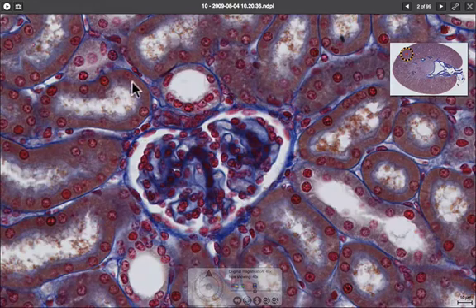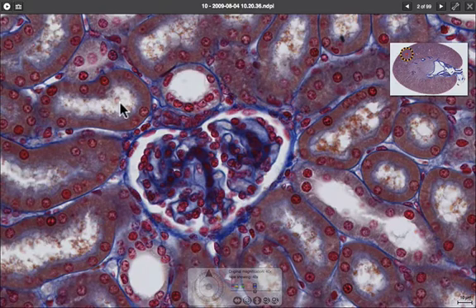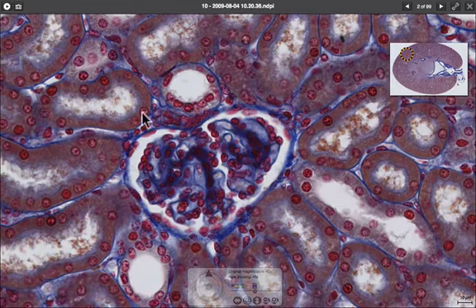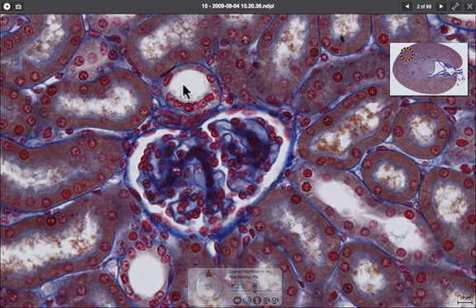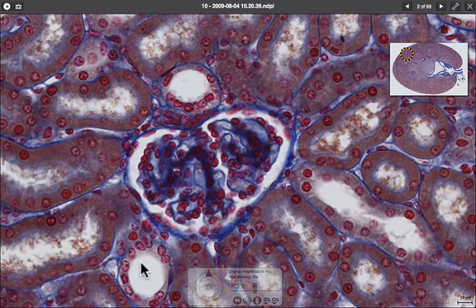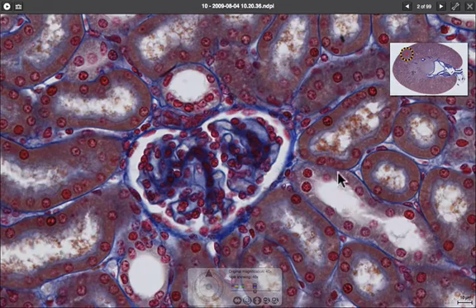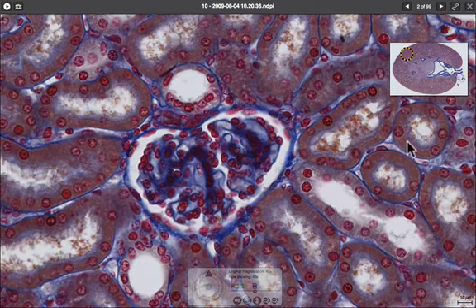There are tubules with a quite fluffy centre where the lumen isn't very clear, and there are ones where the centre is quite open. The ones where the centre is quite open are the distal convoluted tubules, and most of the rest of what we can see are proximal convoluted tubules.